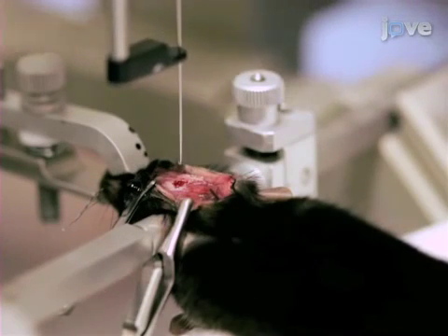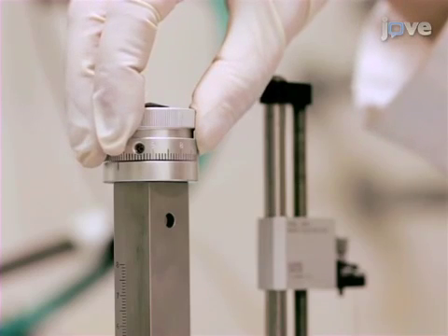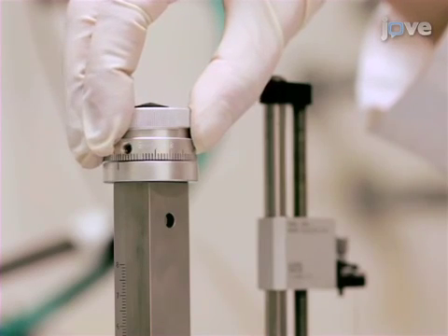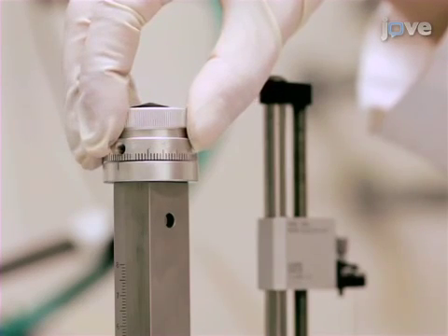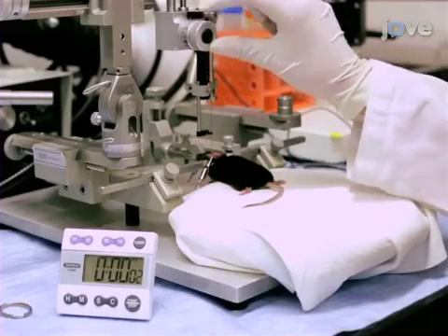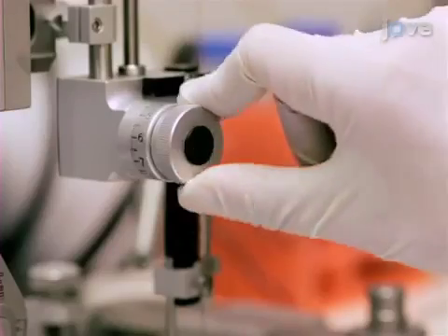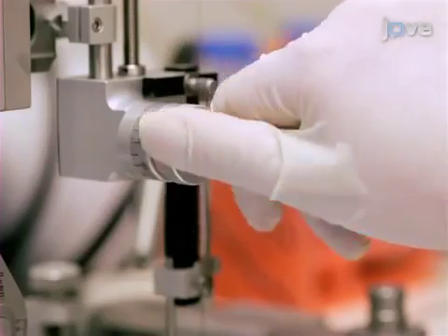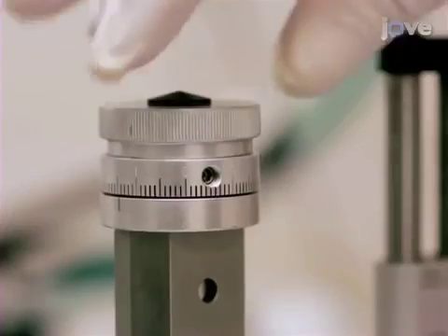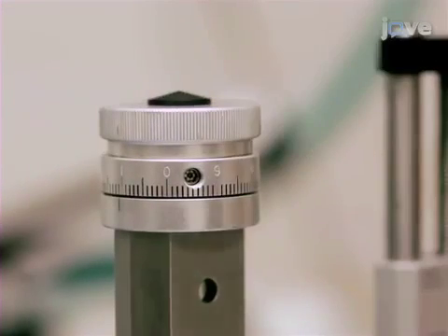Lower the needle to the desired ventral coordinate. Once the coordinate is reached, dip 0.015 mm below it for around 10 seconds to create a small pocket for the viral vector. At a rate of roughly 0.1 microliters per minute, inject the desired volume of viral vector. After waiting 3 minutes for the viral vector to diffuse, raise the needle tip 0.015 mm and wait an additional 2 minutes.